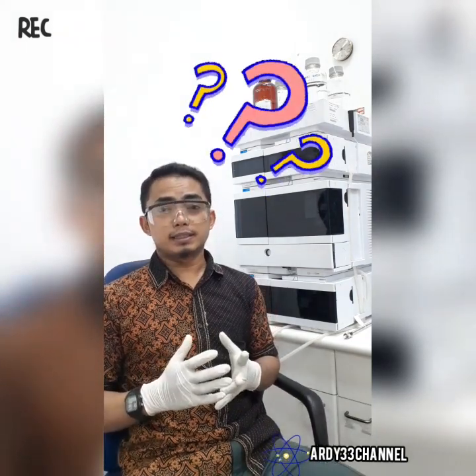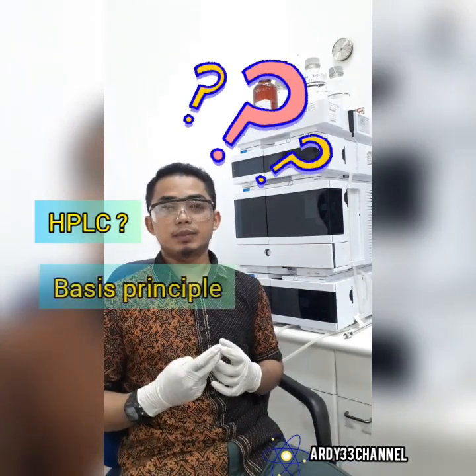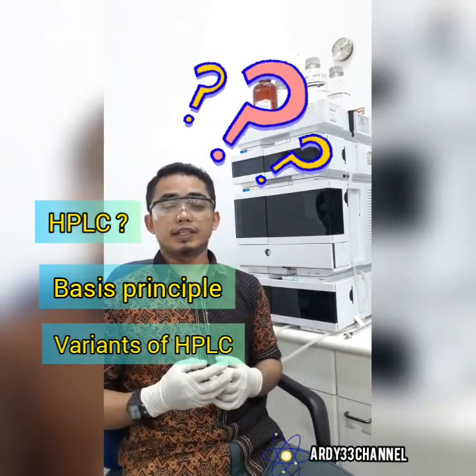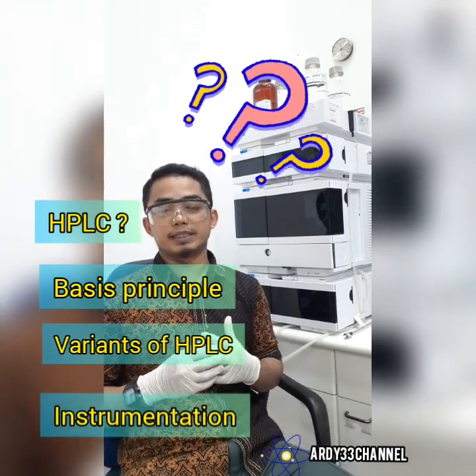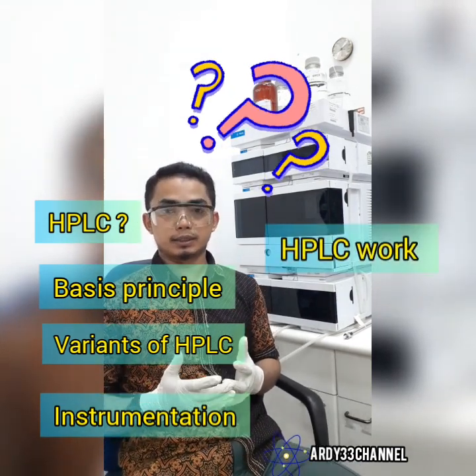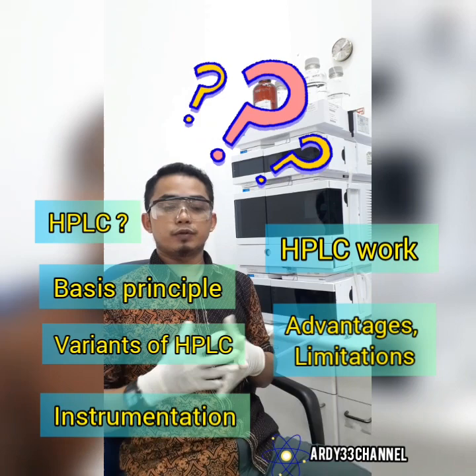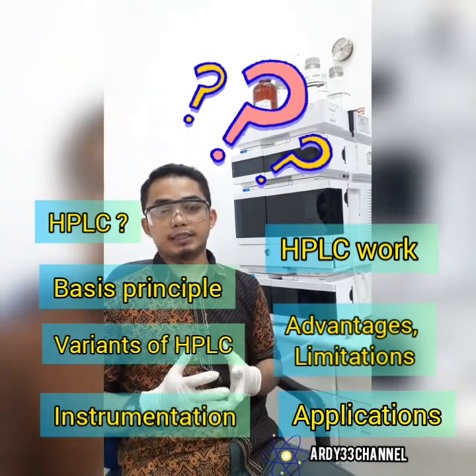What are we going to discuss? Number 1, what is HPLC? Number 2, what is the basic principle of HPLC? Number 3, what are the variants of HPLC? Number 4, what is the instrumentation of HPLC and what is its function? How does the HPLC work? What are the advantages and limitations of HPLC? And the last question, what are the applications of HPLC?